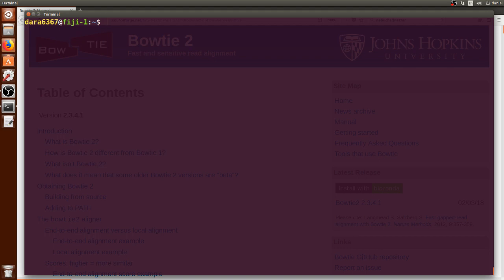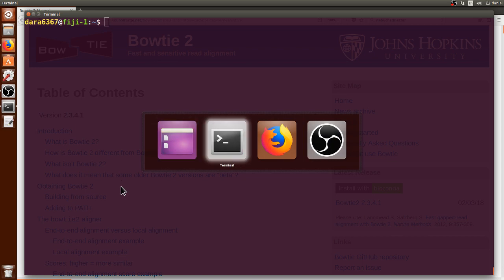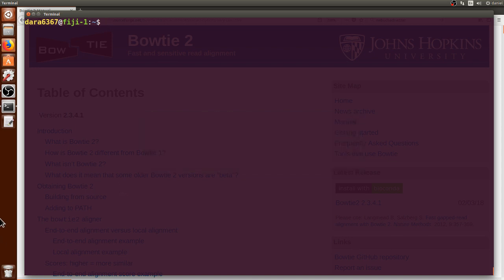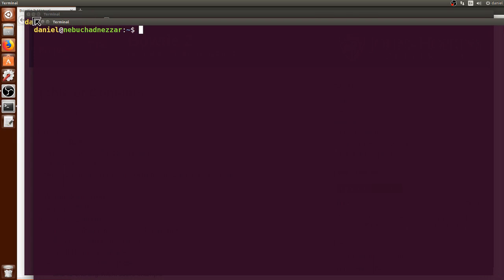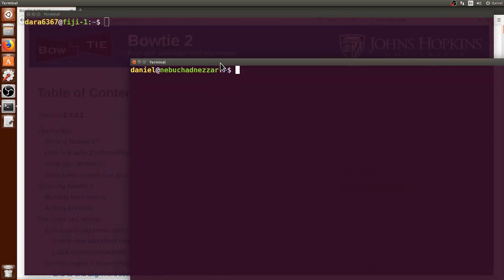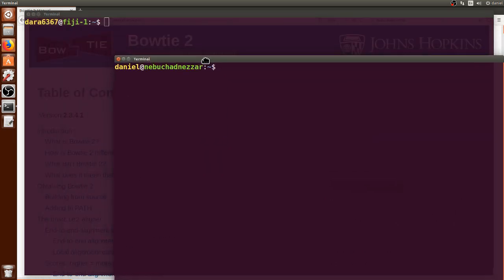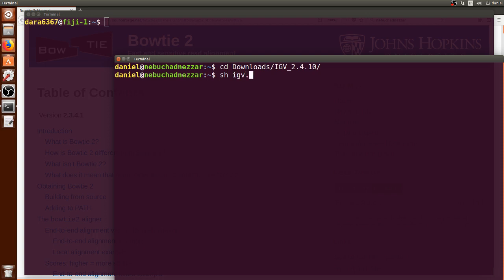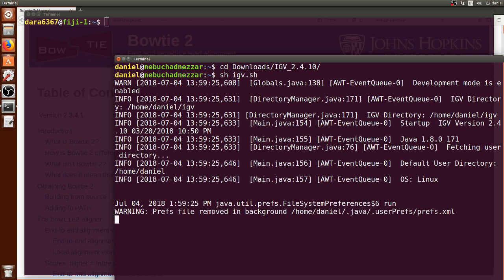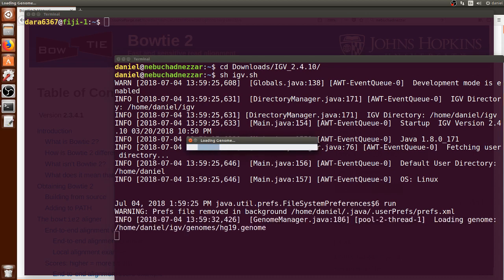So we can exit, clear the screen. I already transferred the BAM files and the index to my own computer. Let's open a new terminal to open them. This is using my own computer, not connected to the cluster. I'm going to use the Integrative Genomics Browser to open these sorted BAM files. We can use bash and the name of the IGV and just press enter and it will take a couple of seconds to load.